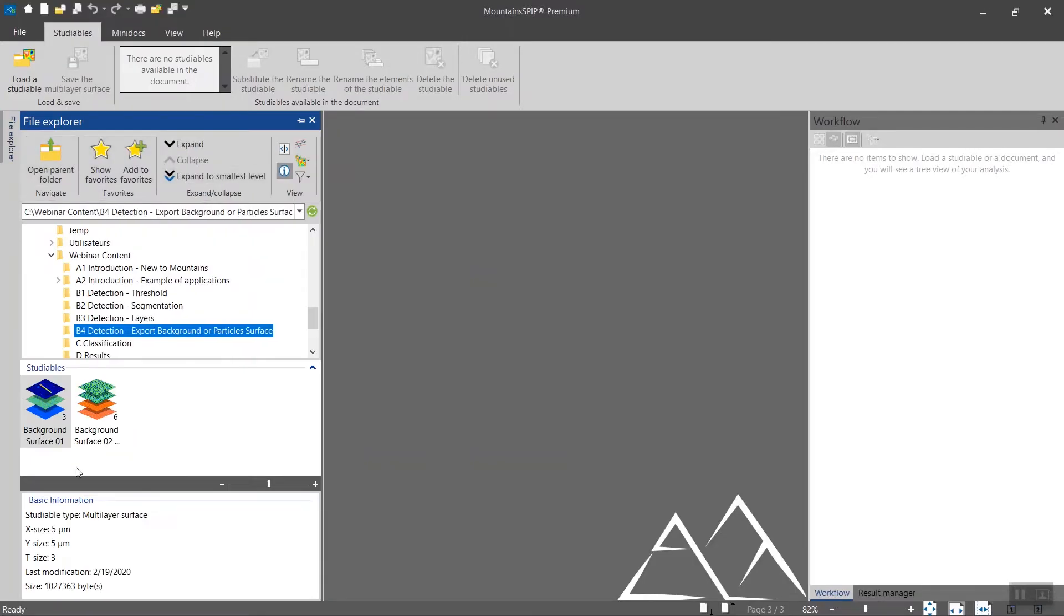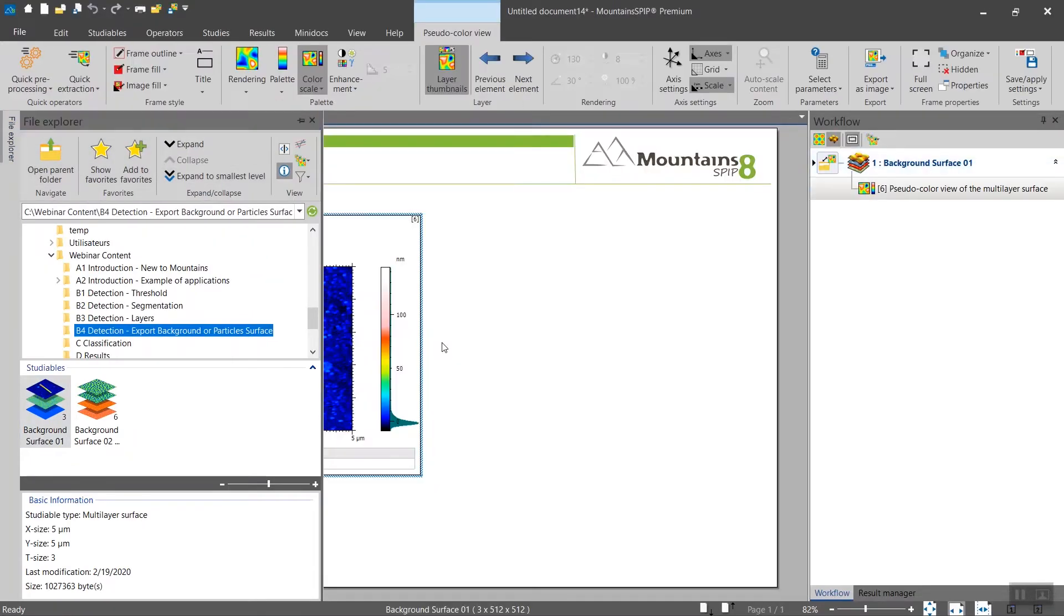Another application of the particle study is for masking specific features, and I have isolated two examples for that. So let's start with this one.